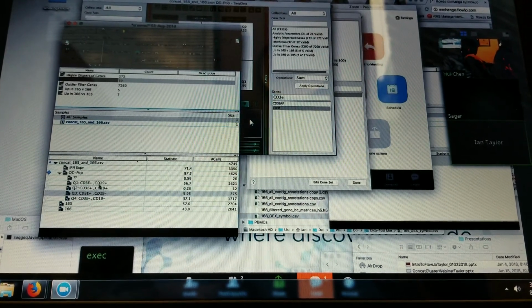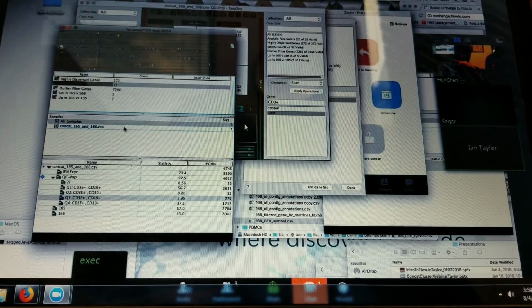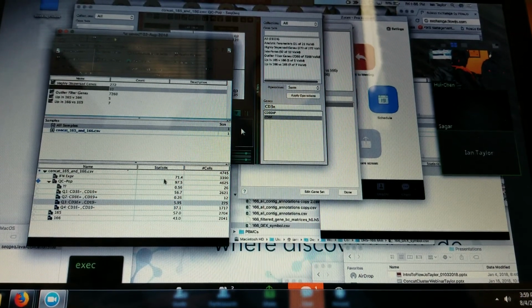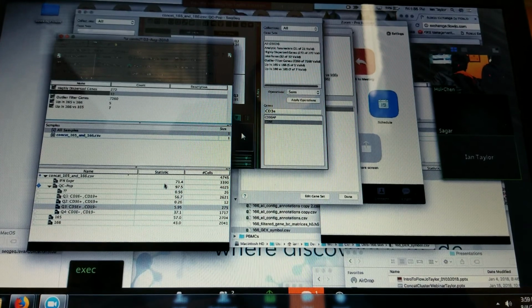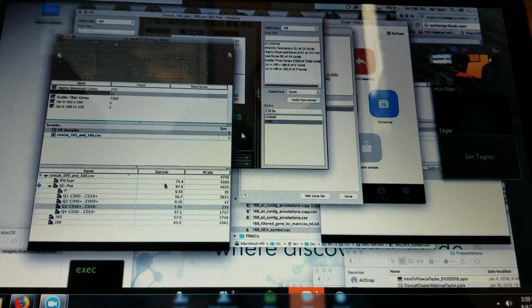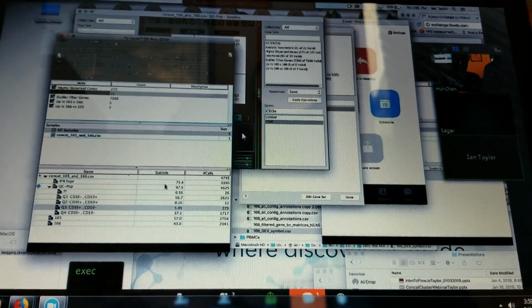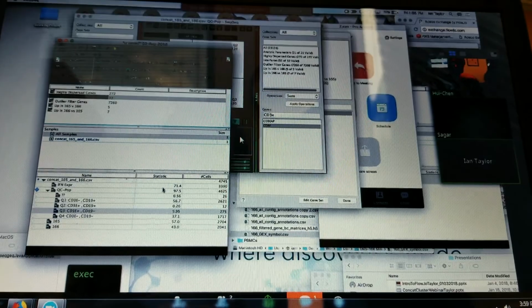And more background here. All of these, except for the gene sets, the rest of this dialogue is very similar to what's available in FlowJo. So I'm just guessing that probably you're not a flow person, you're coming from a different kind of world, and so I can totally understand why this is a foreign concept. No, I am a flow person. Oh, okay. It's still a foreign concept. Got it, okay.